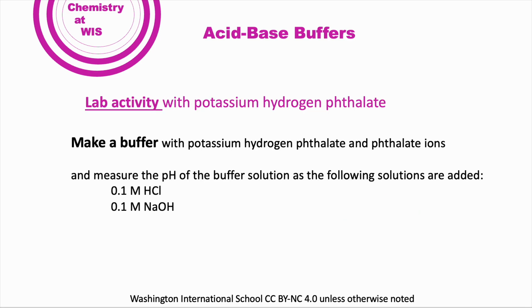So we're going to make a buffer and investigate how it changes when small amounts of the following solutions there, the HCl and NaOH, are added.